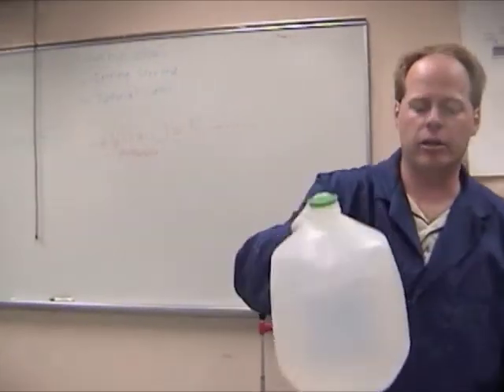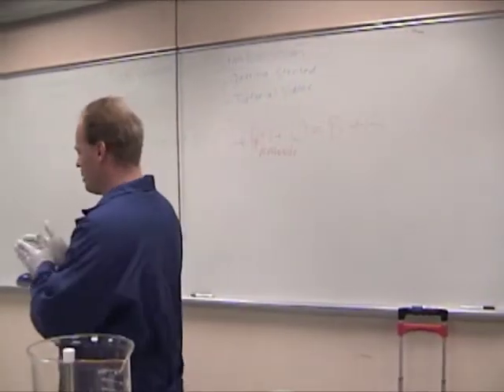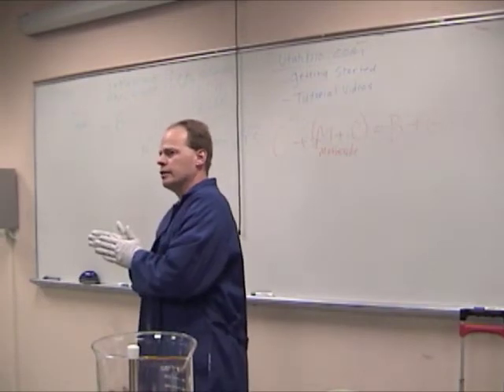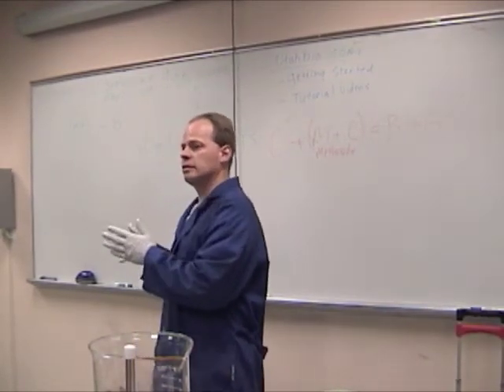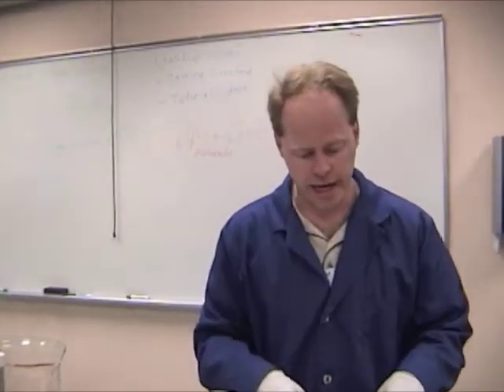It's kind of like I heard a story of a guy flying an airplane. If you're off by 1 degree, flying an airplane around the world, when you come around to the other side of the world, you're off by 500 miles. Same basic principle is true with titration. So you want to be as accurate as you can.